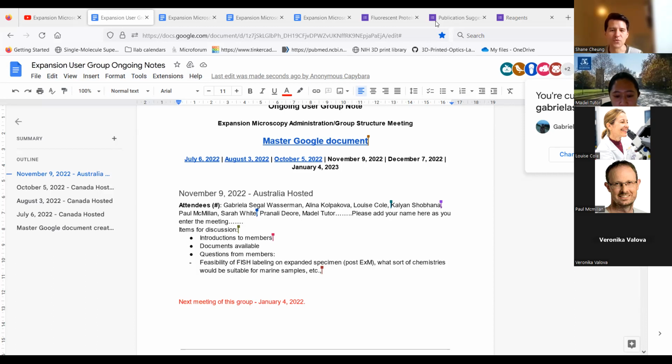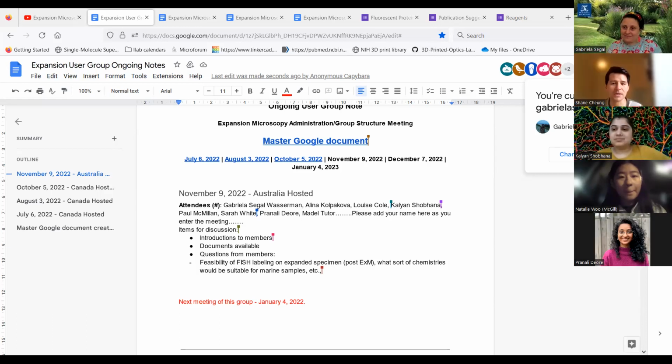But finding out that there's more people interested in doing it has kind of spurred me on to be more interested. Natalie, you're nodding your head, so I'm sure that's a comment you've heard a few times before. And one of the microscopes I look after in BOMP is a STORM system. And we have a lot of people looking for super resolution, but the sample preparation and the imaging setup with that isn't always amenable to every sample.